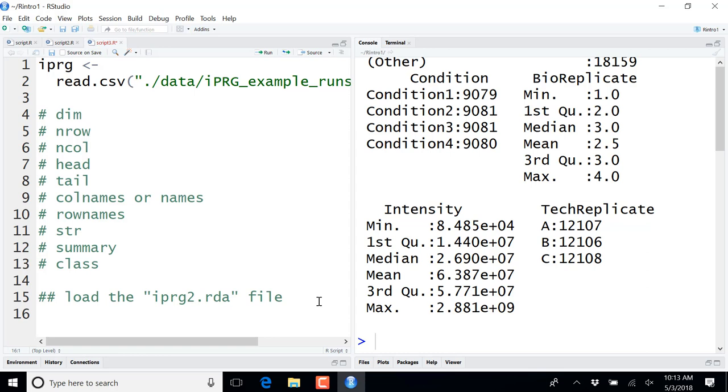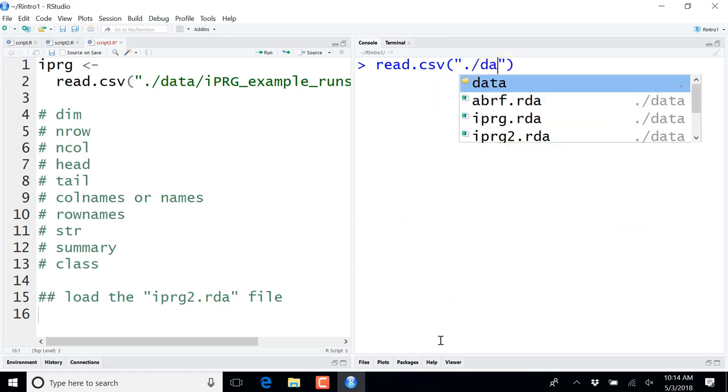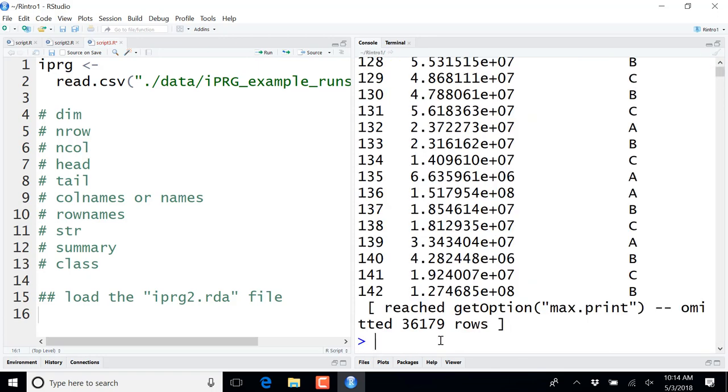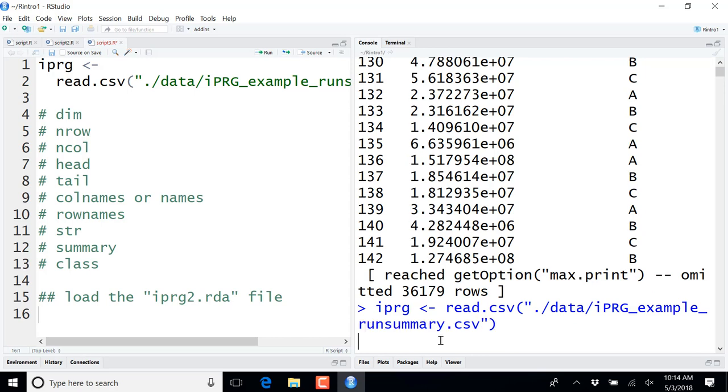So, read.csv reads a CSV file, a comma-separated file. Read.csv will parse the file, take the first row, split the first row based on the comma, and do this for all the rows, and then create a data frame. The data frame is then returned from the function and printed on the console. But it's kind of lost for me. I can see it, but it's not stored. So with read.csv, it returns a data frame, and I would then store it in a new variable.